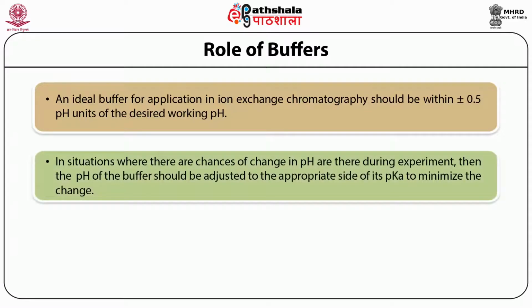In situations where there are chances of change in pH during the procedure or the experiment, the pH of the buffer should be adjusted to the appropriate side of its pKa value to minimize the change.